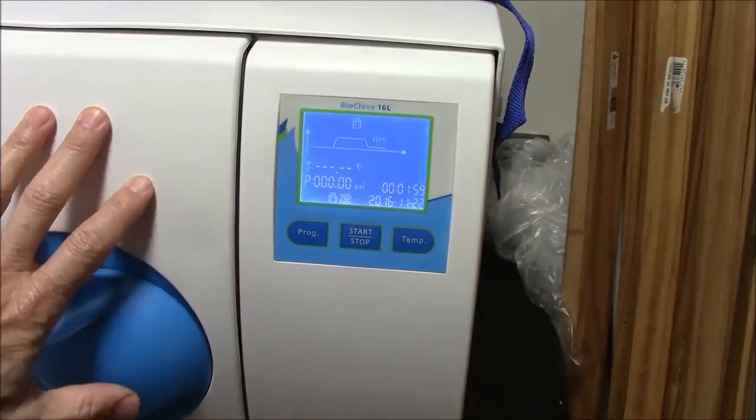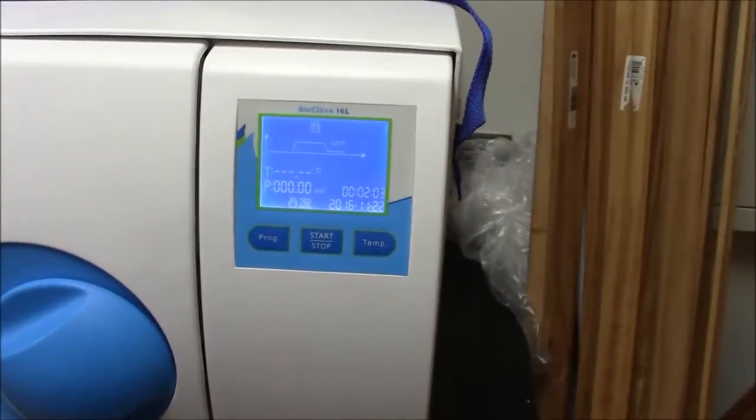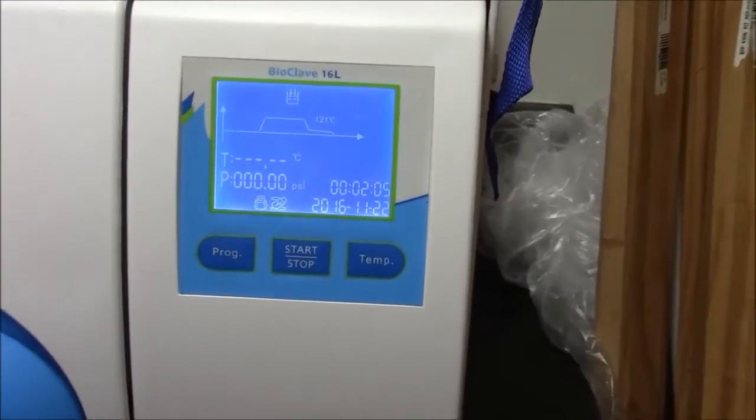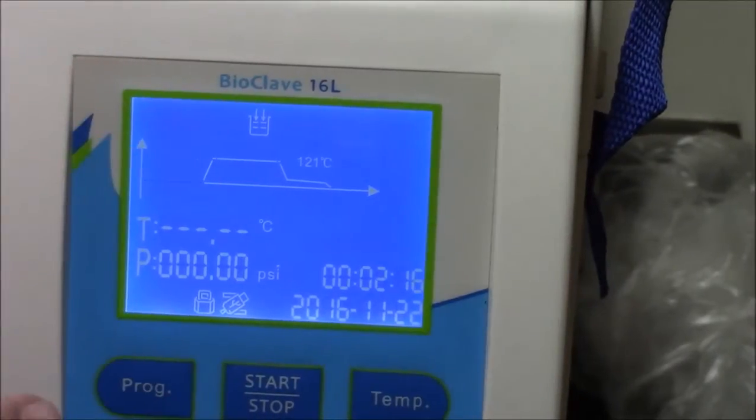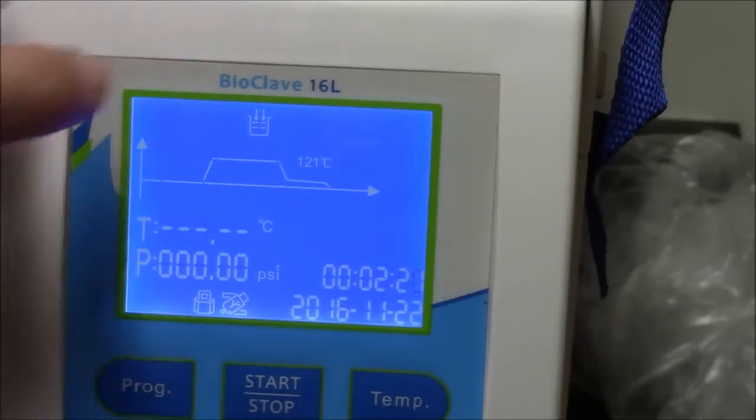I put my materials inside. This is the control panel. There are different programs. I'm using the sterilized liquids program which has this beaker with liquid inside it.